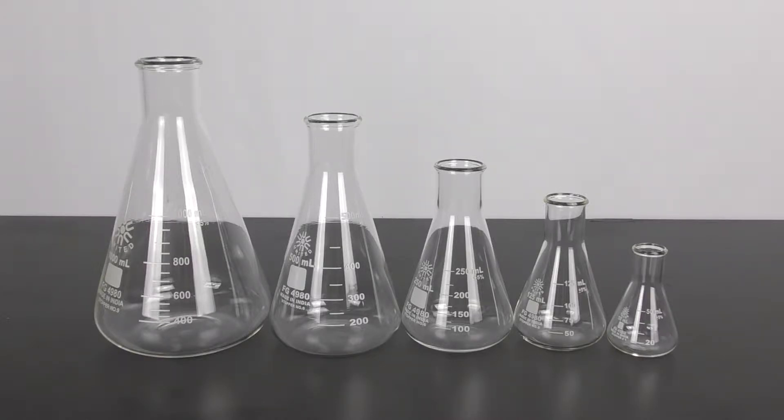The set consists of five narrow-mouth borosilicate glass flasks. The set includes 50, 125, 250, 500, and a 1000 milliliter flask.